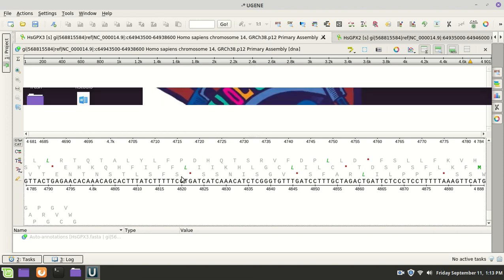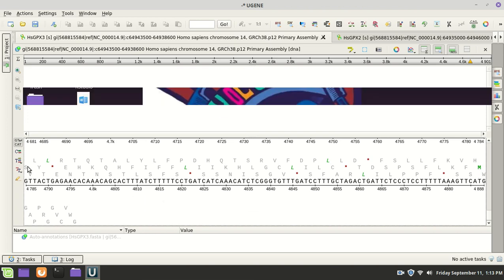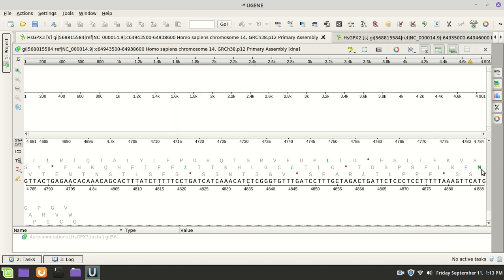Now, of course, these start with methionine. So if we're looking at it, we might see here methionine. Maybe this is in this middle reading frame. All right, and we would start here, ATG, and that T goes up to the M, so that's methionine.